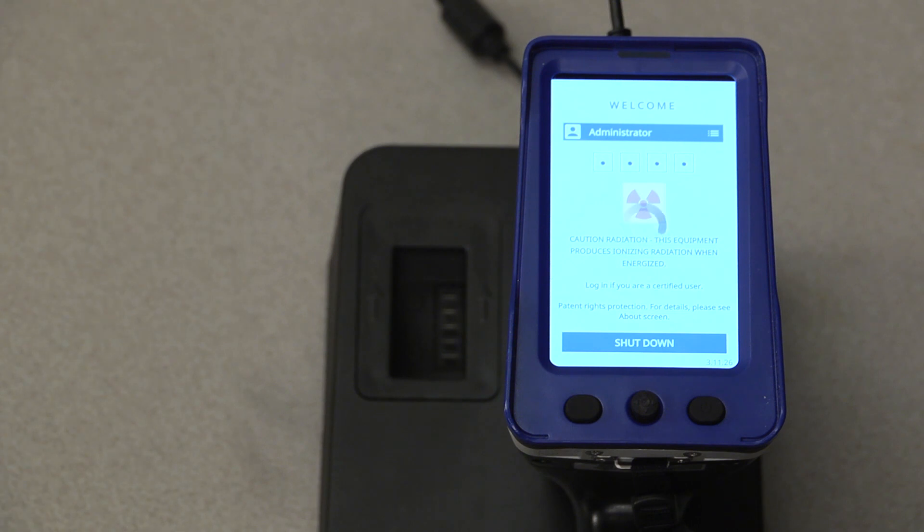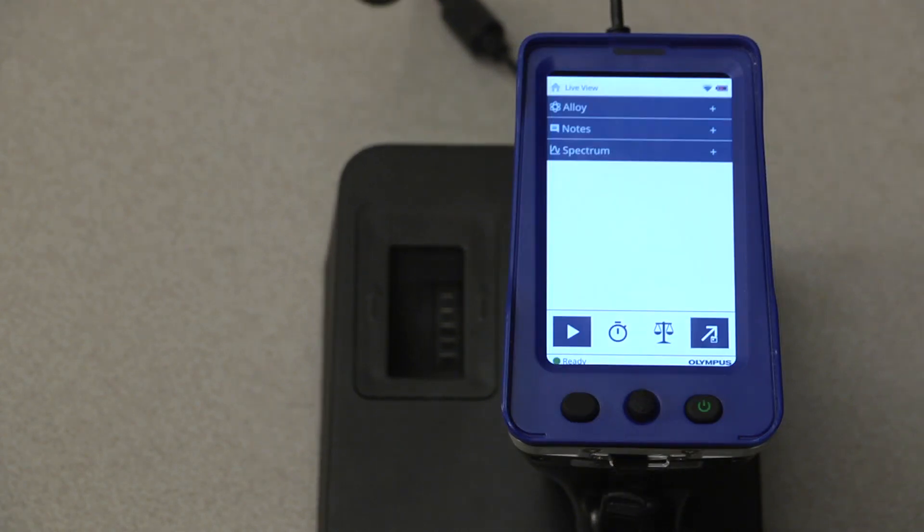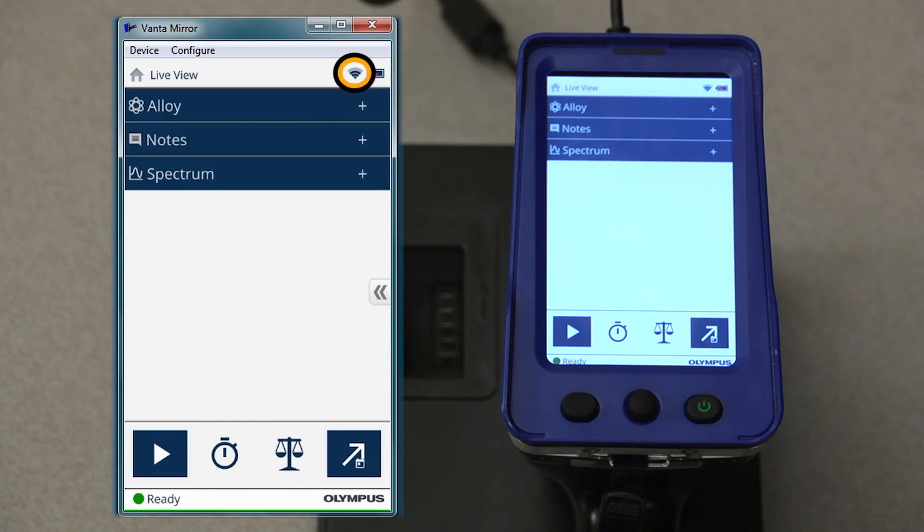In order to update the Vanta software wirelessly, first log into the instrument using the administrator login. Once logged in, ensure that the wireless connection is connected and enabled.